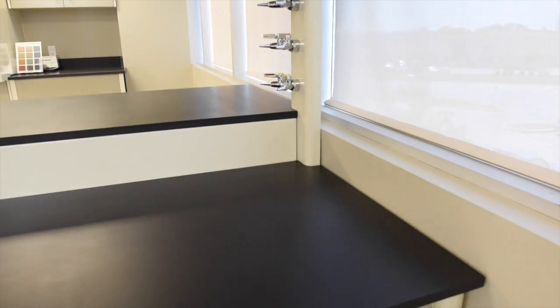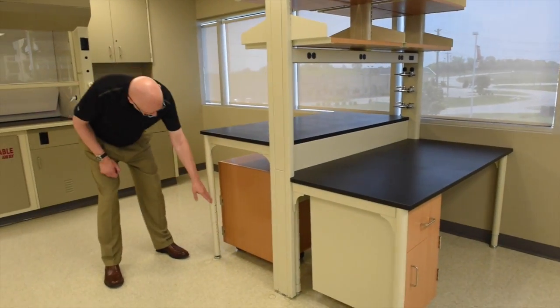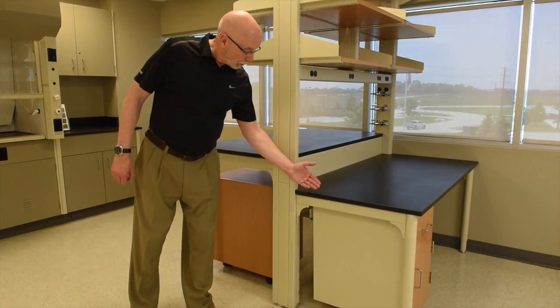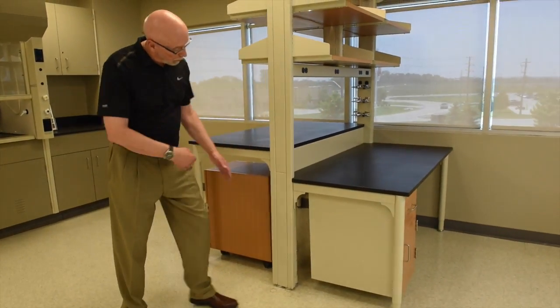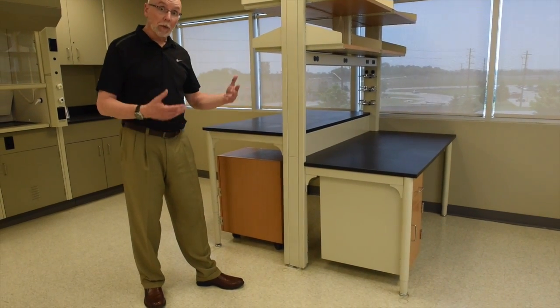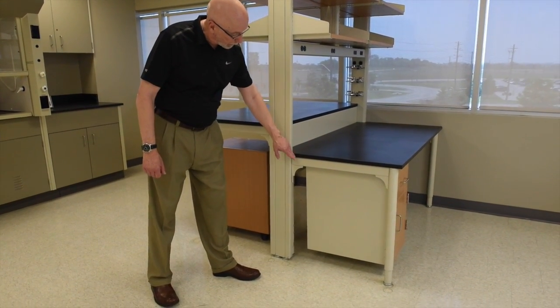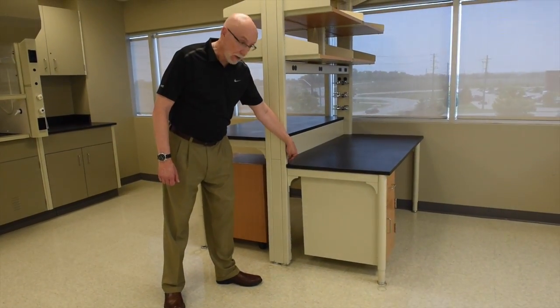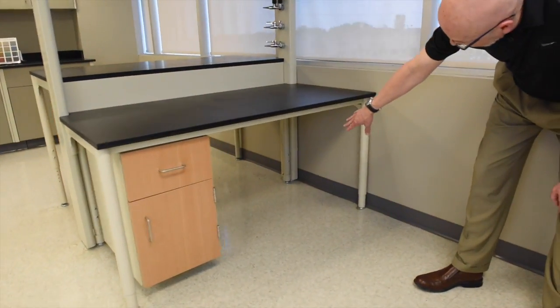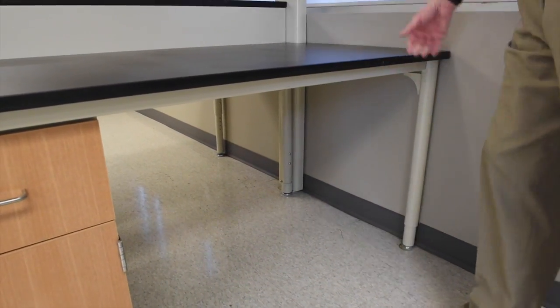You'll see that there are two worktops. The top on the left bolts to the upright and has a telescoping leg so you can go from sitting height to standing height. The table on the right looks just like it, but it's not bolted on. What we've done to make this unit more flexible, more adaptable, more reconfigurable is instead of having this side bolted on, this is actually a four-legged table that nests inside here. If you look down here, you can see that the back leg of the table has a little hook brace attached to it that keeps this securely tied in to the entire unit.